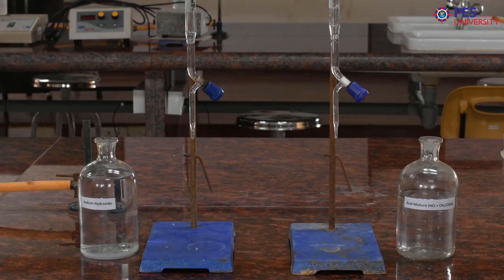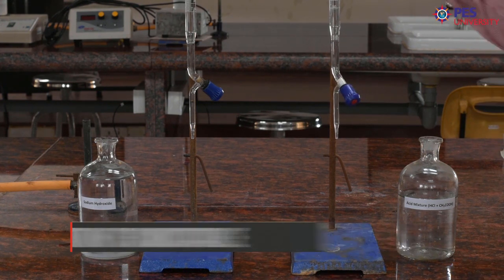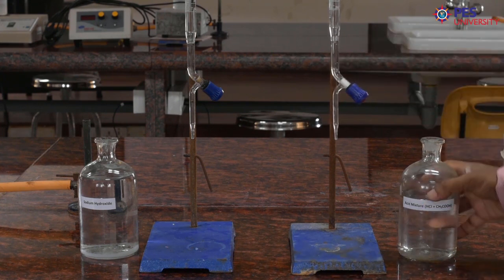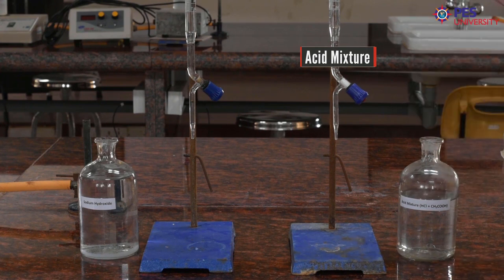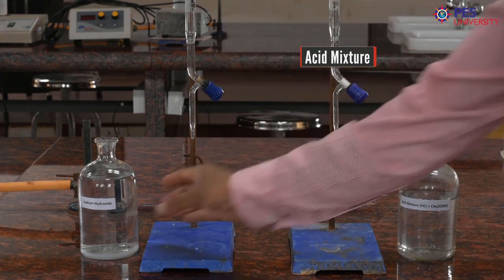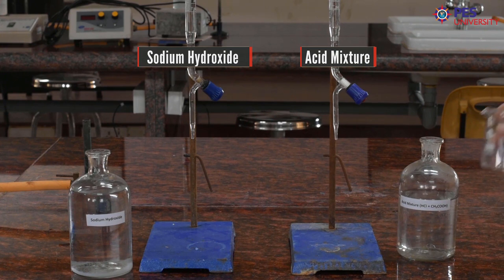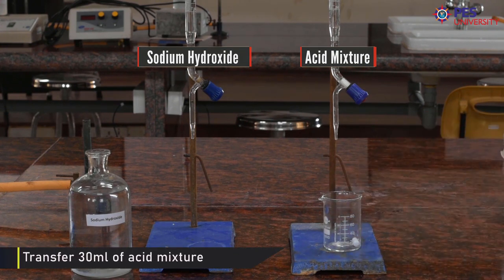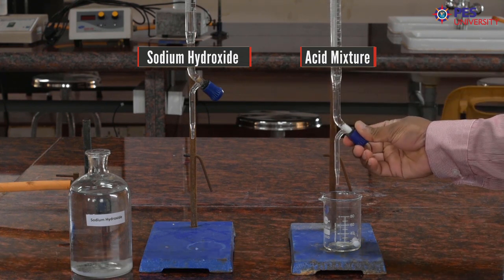Let us move on to the second part of this experiment. For that, first you need to take 2 burettes and fill one burette with acid mixture, that is HCl and acetic acid, and another burette with sodium hydroxide solution. After that, transfer 30 ml of acid mixture into a beaker.